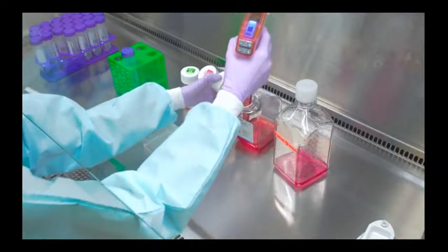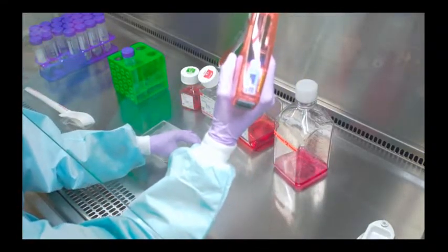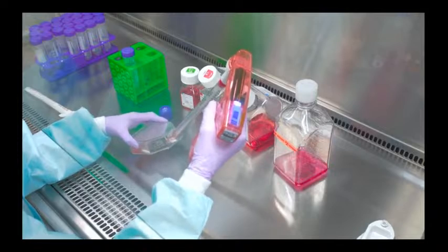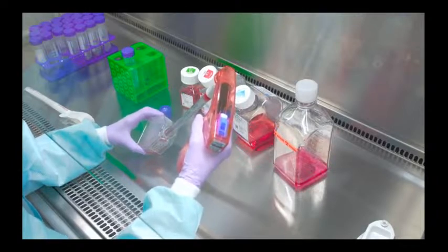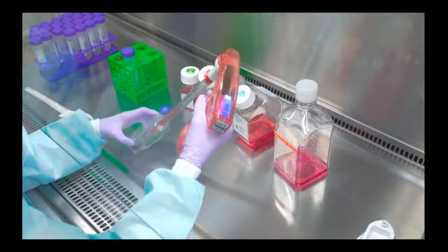You may choose to manually break up lingering clumps by repeatedly pipetting warmed medium over them. A single cell suspension is important to achieve an accurate cell count. If you are using trypsin, the collection medium will need serum, or you'll need to use a trypsin inhibitor to inactivate the trypsin. If you're using TrypLE, inactivation is achieved by dilution alone. No serum is needed.